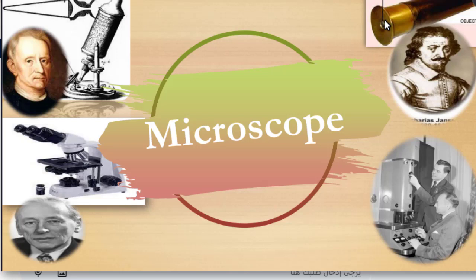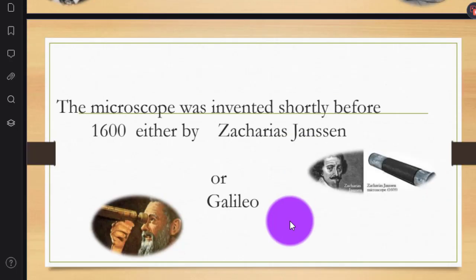By studying microorganisms under a microscope, a microbiologist or lab technologist or technician can gain a better understanding of their biology and how they cause diseases. Also, this information can be used to develop new diagnostic tests and treatments. Now, the historical background about the microscope.